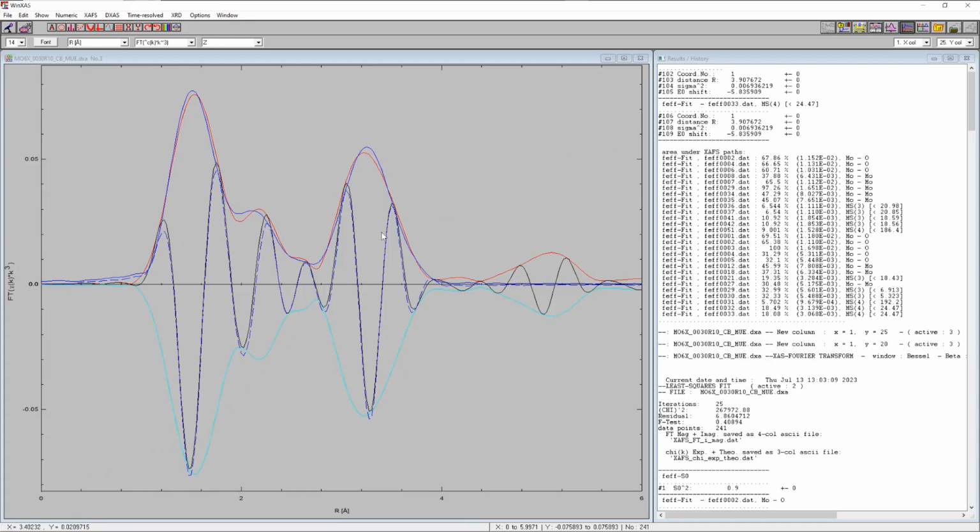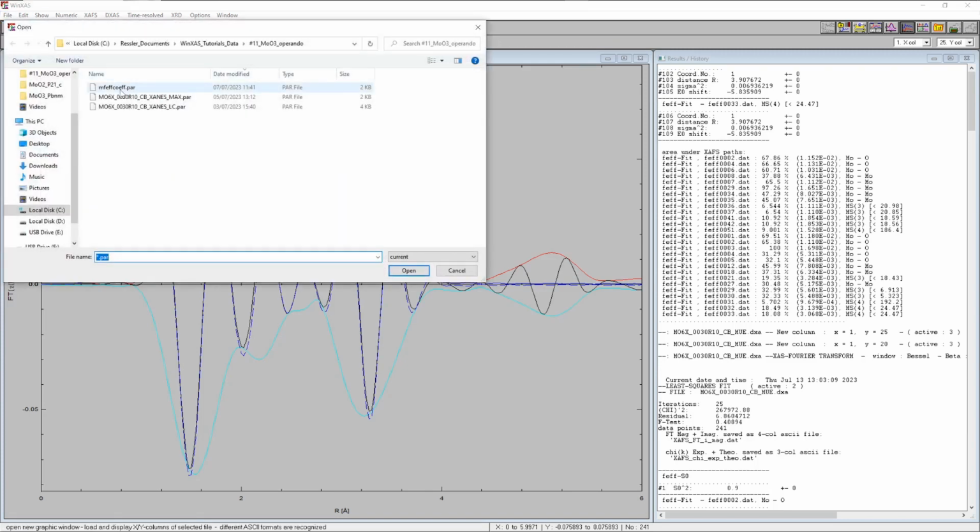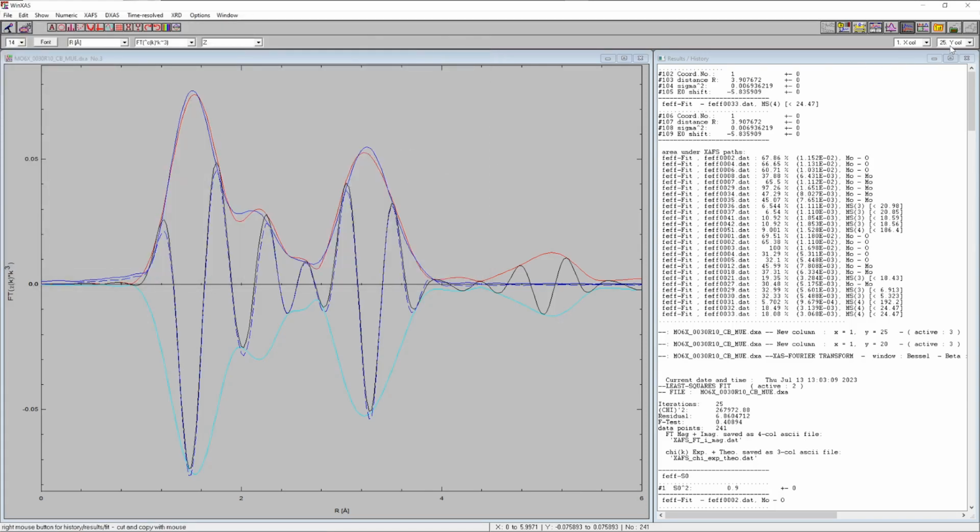If you do not want to use this file here, this parameter file, for the refinement for whatever reason, then you need to either delete it or rename it. If it's there, the program is going to use it. So, okay, so this is column 25.